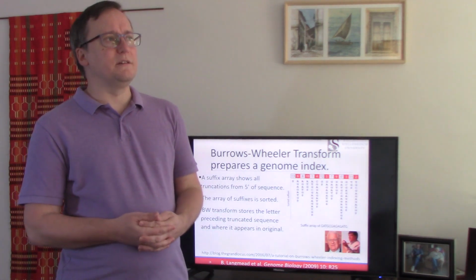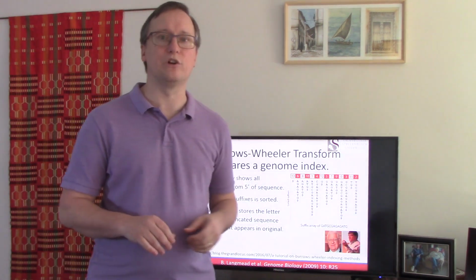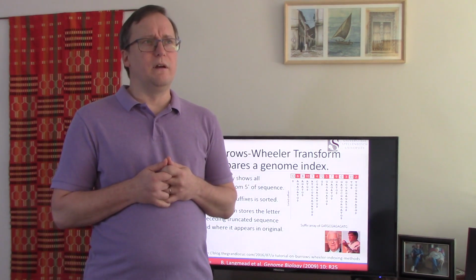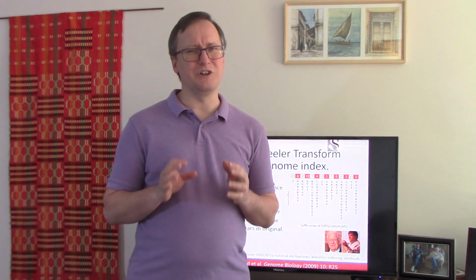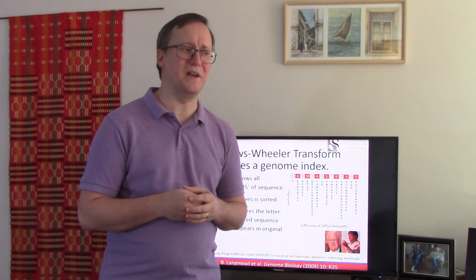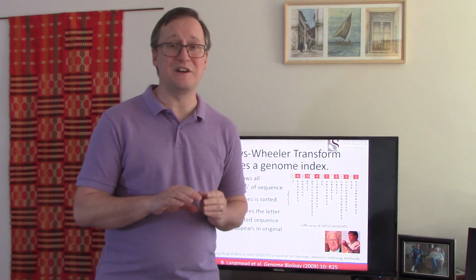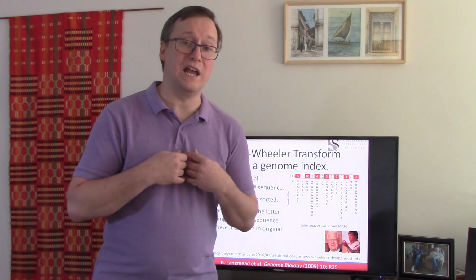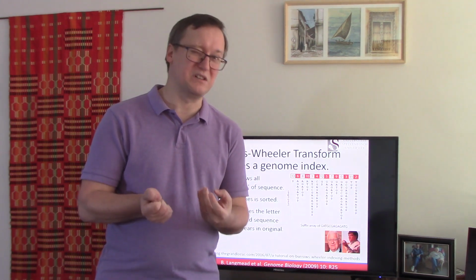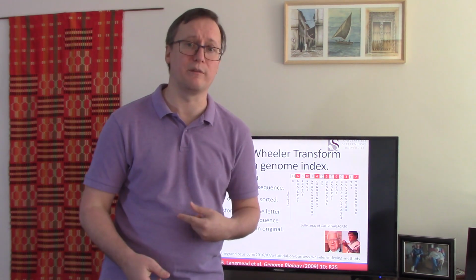Now, I would say that the Burrows-Wheeler Transform or Burrows-Wheeler Alignment algorithm are not the best understood of the tools out there, even if they're very widely used. So I'm going to try to explain these in a fairly gentle way. There are going to be some places where my detail of the algorithm will be less than complete. So if you're a computer scientist watching this, I would advise you to watch any of the videos or read any of the papers or look at any of the tutorials online for the algorithmic insights of this. At the moment, my goal is that biomedical students have some notion of what BWA is doing for them.